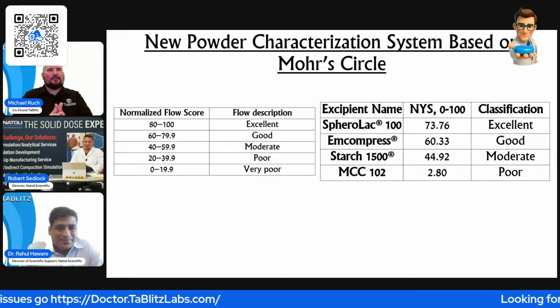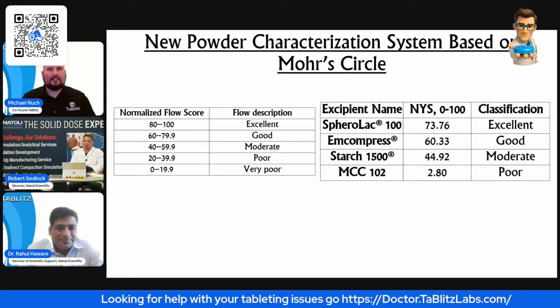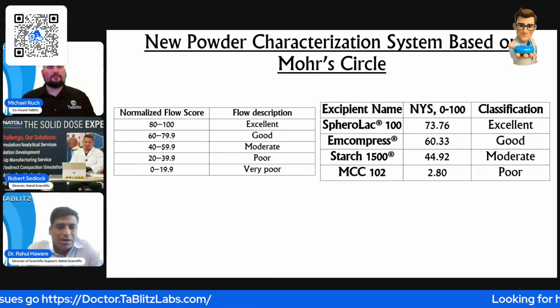Our next episode is going to be completely on the sticking index, how we quantify it, how we measure it, and then how to utilize it in your process, using the powder rheometer. Absolutely. And that is an in-house technology in collaboration with Long Island University, of course.